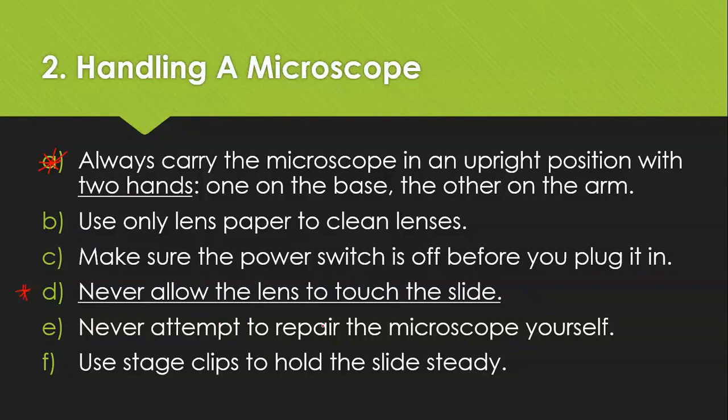Don't try and fix the microscope yourself. In fact, we have a special person that comes in once a year to fix our microscopes. Just let me know if there's something wrong. If I can fix it, I will, but otherwise we set it aside and let an expert do it.